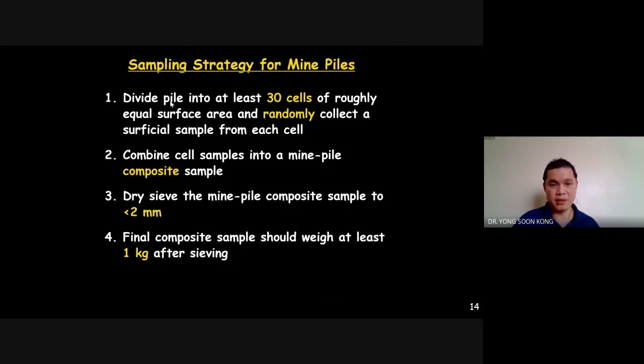I think I'm going to skip this part because, if you look carefully, point 1, point 2, point 3, and point number 4 are exactly what you did before during soil chemistry. This is one way we collect soil samples: sieve it to less than 2 mm, and then we do composite. But of course, there's one more. Once you do this composite in 1 kilogram, there's point number 5. You need to downsize. You need to reduce the sample size by the quartering method. Quartering. I believe you learned this before. It's just that you have to come back and learn it. Okay? So there's one more point.